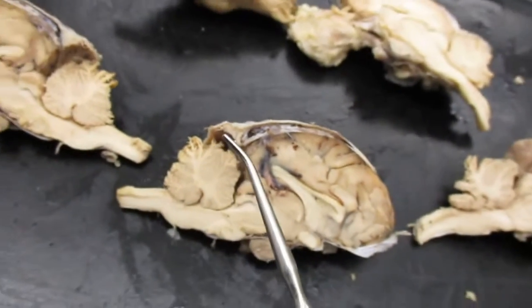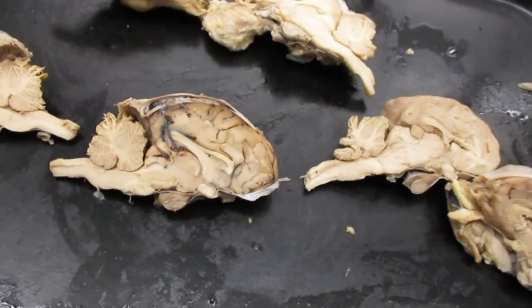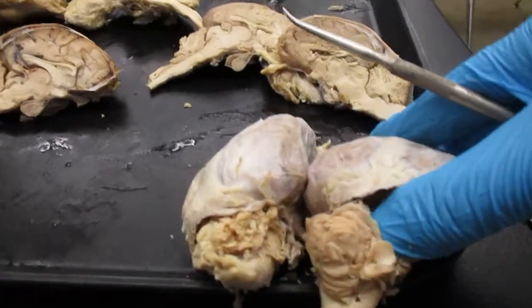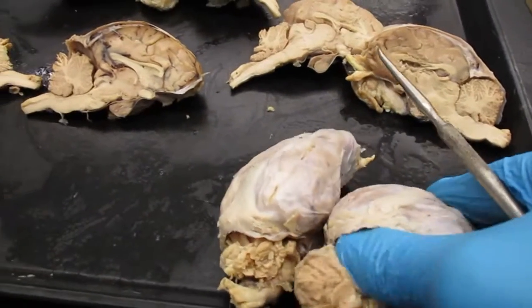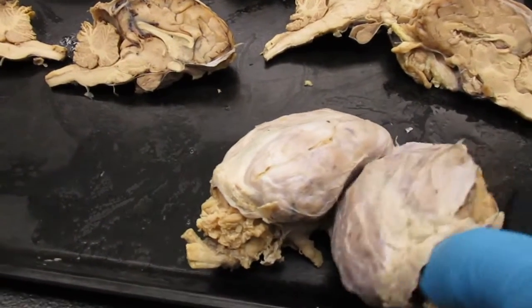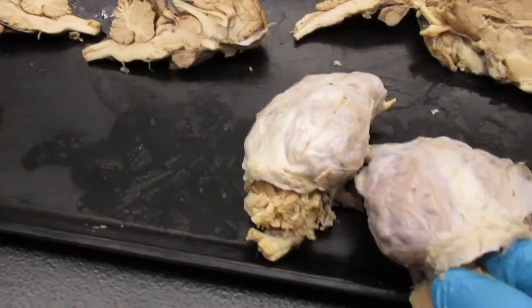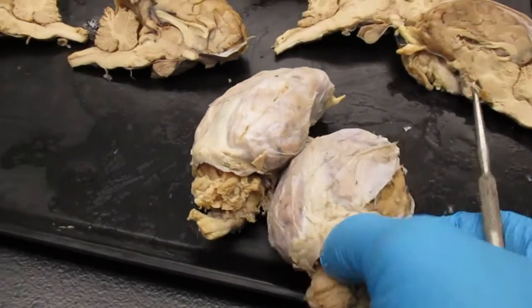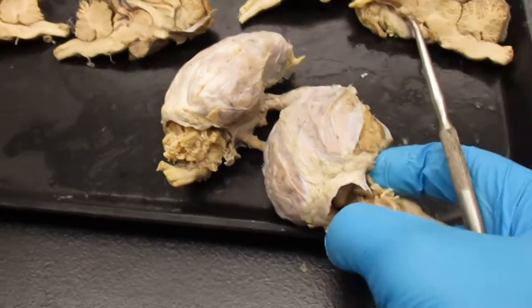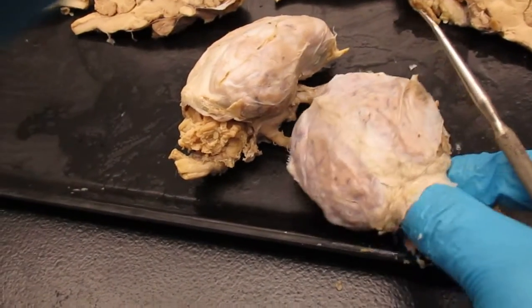Let me show you the corpora quadrigemina right here on the undissected sheep brain. I don't know if you can see it or not, but I'm digging around in the transverse fissure, and I don't know if it'll show up. It doesn't want to show up. I wanted to show you the four bodies. I can't get it to do right.